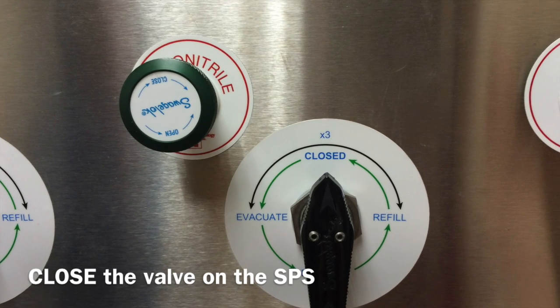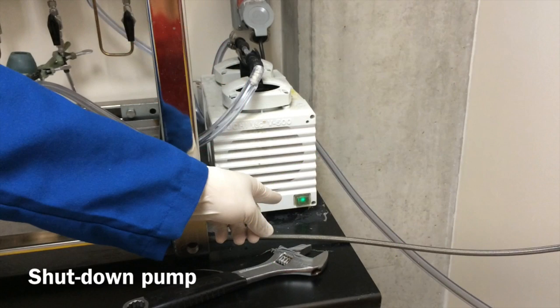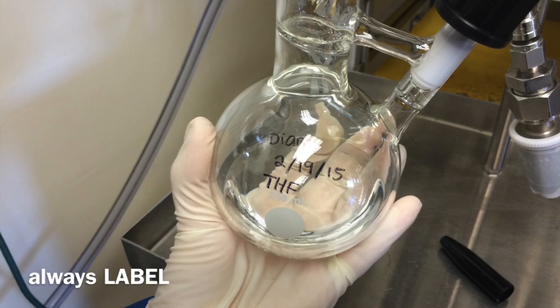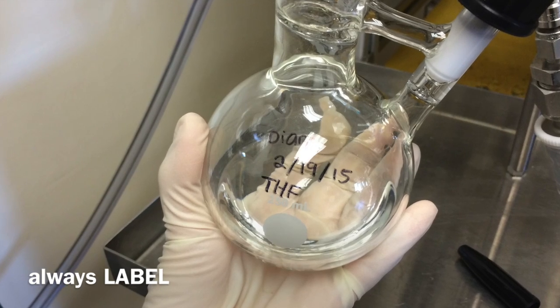Then, close the valve on the SPS. And shut down the vacuum pump. Remove the Strauss flask for use on your own Schlenk line. Be a responsible chemist and label the flask with your name, solvent, and date.